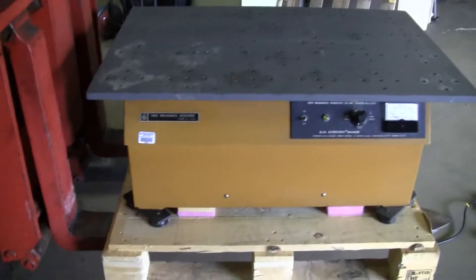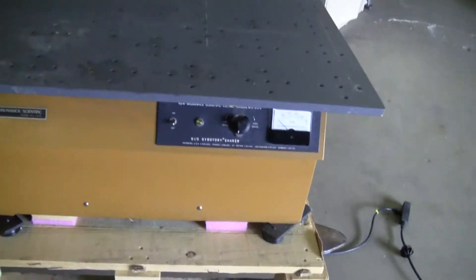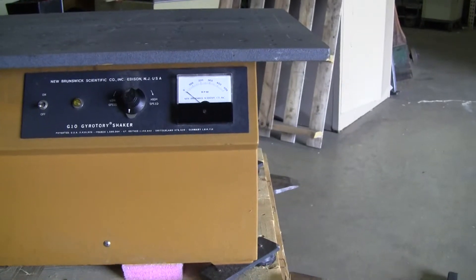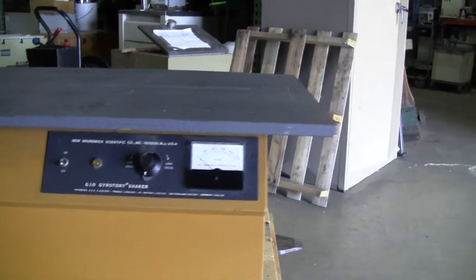Hi, this is Jim from High Tech Trader. We're looking at a New Brunswick Scientific Gyratory Shaker, Model G10. It goes up to 500 RPMs and has a one-inch rotation.